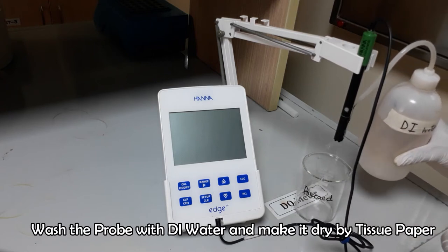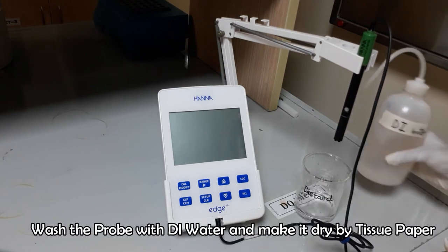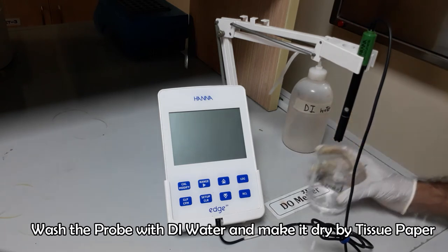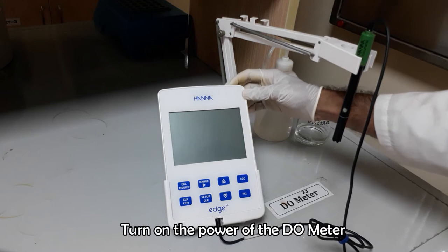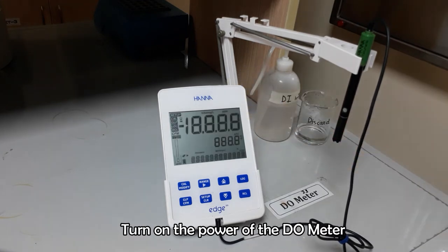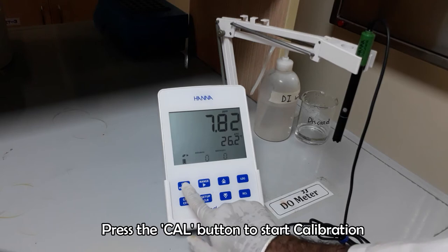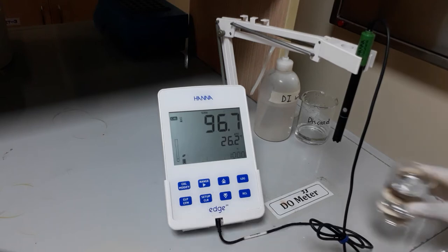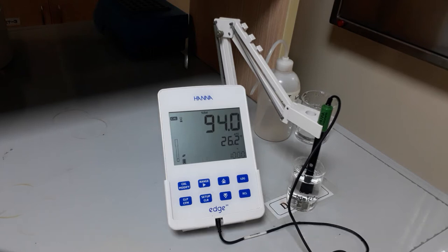Wash the probe with deionized water and dry it by a soft tissue paper. Turn on the power of the DO meter. Press the CAL button and insert the probe into freshly prepared deionized water to adjust the DO at 100%.